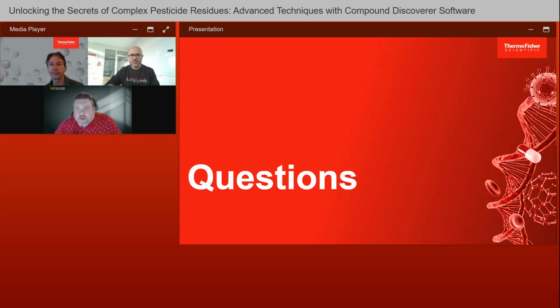So in Compound Discoverer 3.4, for the in-source fragments shown in the related table, does it mean that they will not show as candidate compound in the main table? That's correct. That's absolutely the way it works.